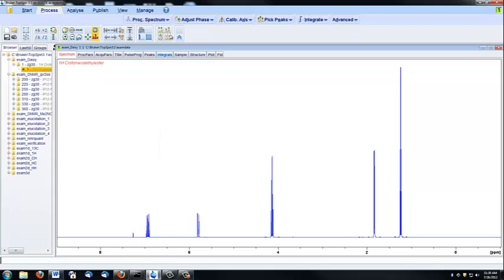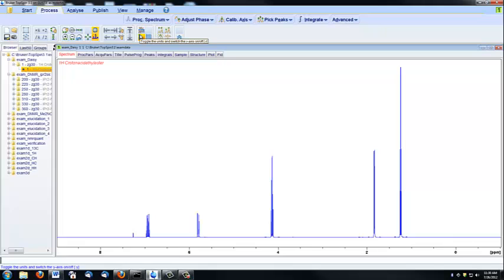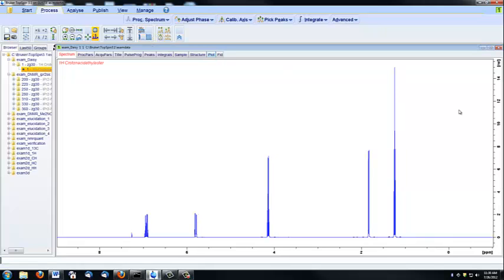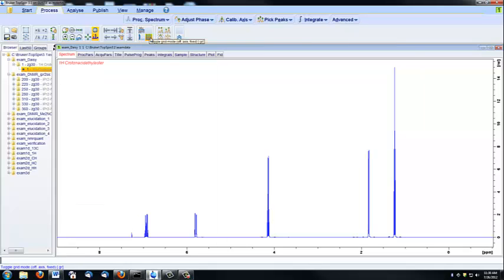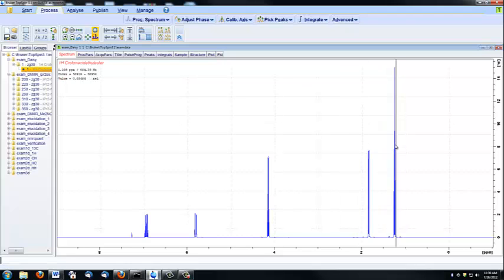If you want to see your spectrum displayed in hertz instead of ppm, you can click here. And to revert, you can just click it again. If you wish to see the y-axis in order to compare peaks with relative intensities, click right here. And you can also put a grid on the spectrum to further help you identify peaks.